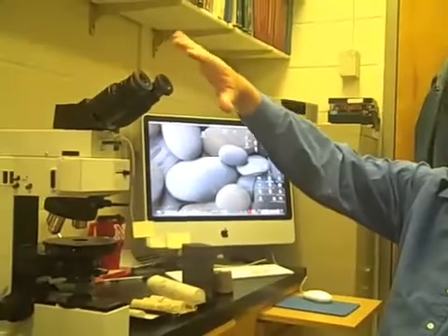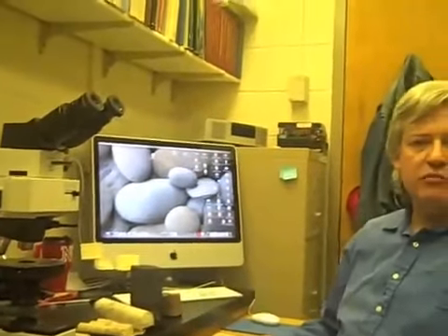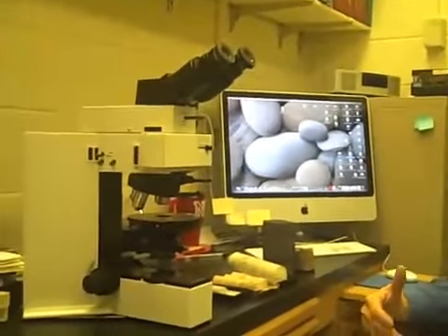This is the setup that is used to analyze a rock in detail in thin section. So the light passes up through the thin section, and I look up here and I'm recognizing different minerals and different characteristics of the rock, different fossil grains, different cements, all of the aspects of a sedimentary rock, which is what these cores are all.